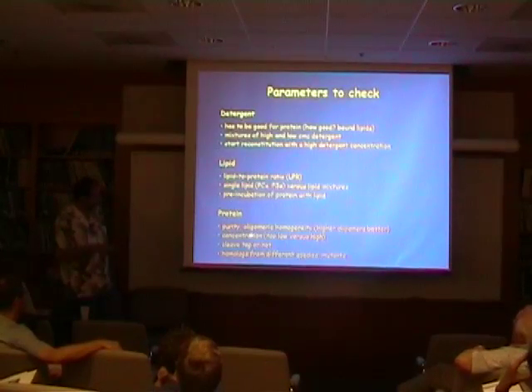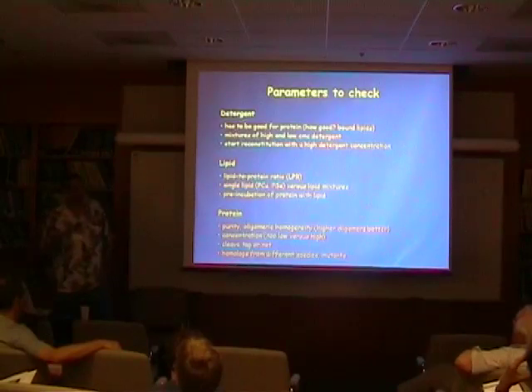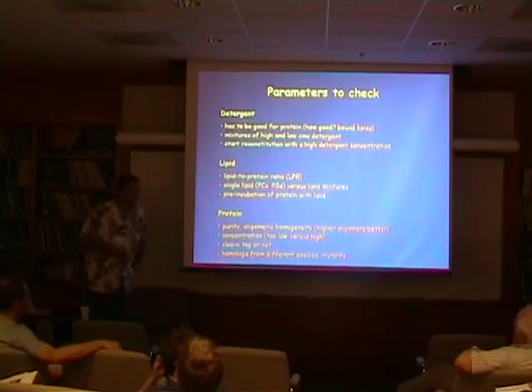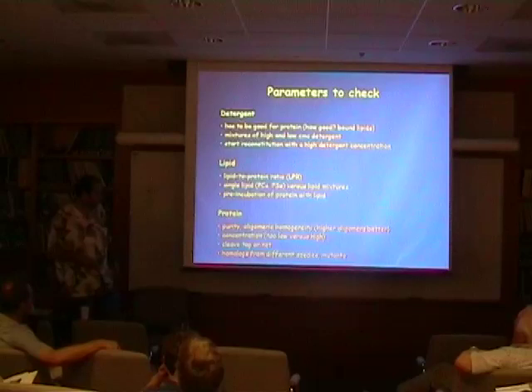Then protein concentration is an issue. If you drop your concentration of the protein too low, and you have a certain lipid to protein ratio, there might not be enough chance that the lipid finds the next protein and the protein comes together. So if you drop the protein concentration too low, you might not get 2D crystals. And what we found, if you raise the concentration of the protein, in many cases you get bigger crystals. Not better ordered crystals, but bigger crystals.